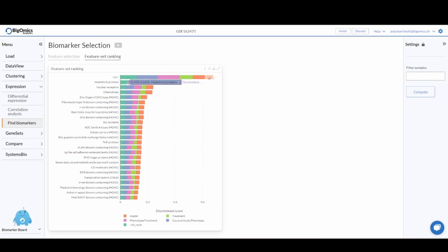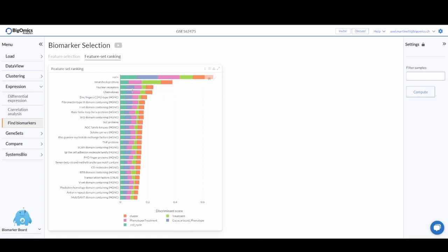Crucially, we can also see that heat shock proteins do not really have a strong discriminatory power for the glucocorticoid resistant phenotype. So if you were more interested in these phenotypes, you might look towards nuclear receptors or chemokines, for example.